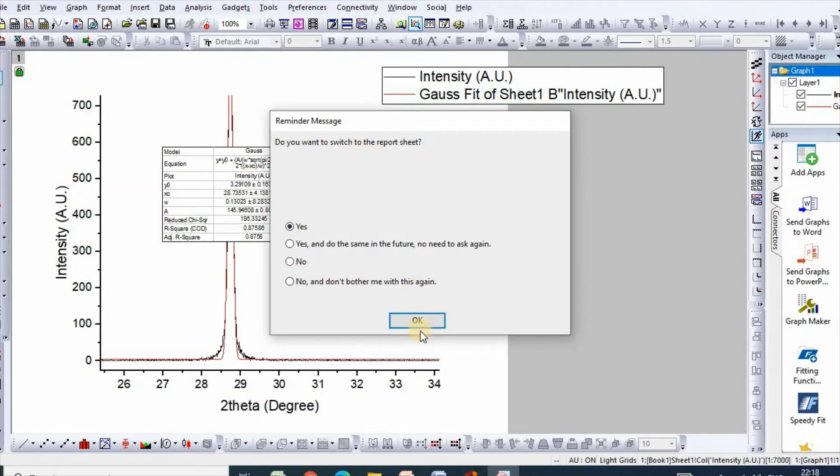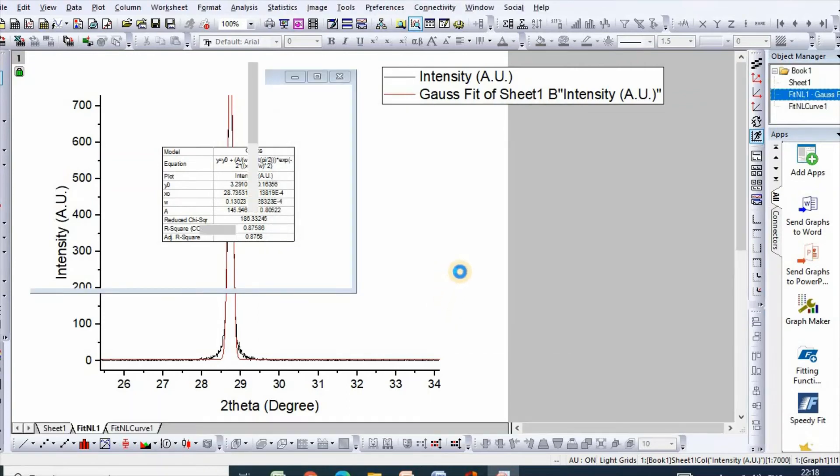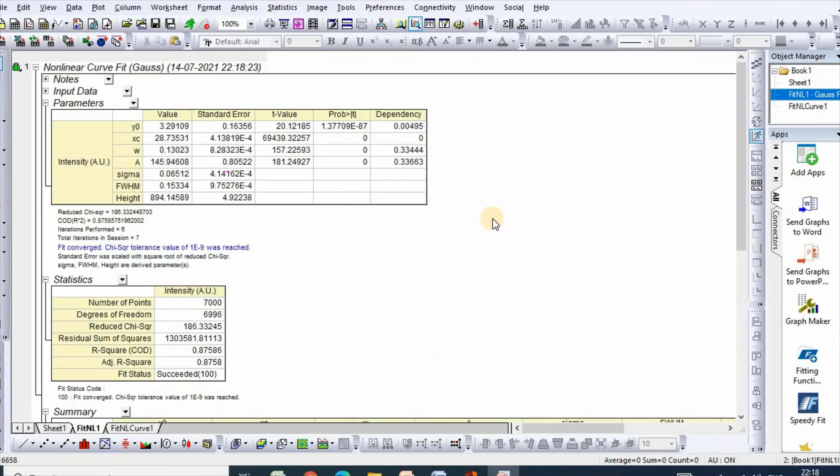If you click yes then your data will be exported. Here is your necessary data for calculation of crystallite size where Xc is peak position which is 28.7353 for my sample and full width at half maxima is 0.15334. I will use these two values for calculation of crystallite size.